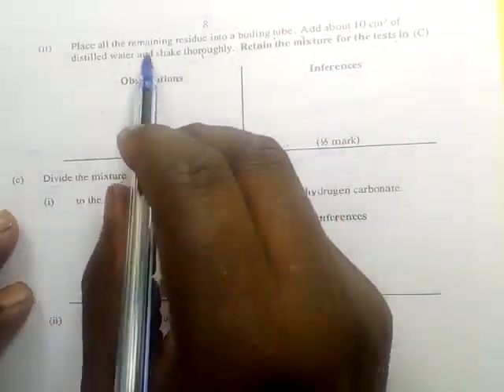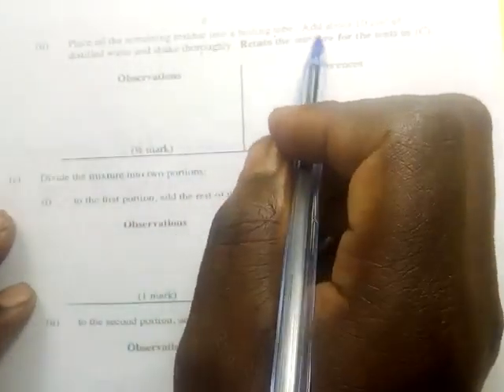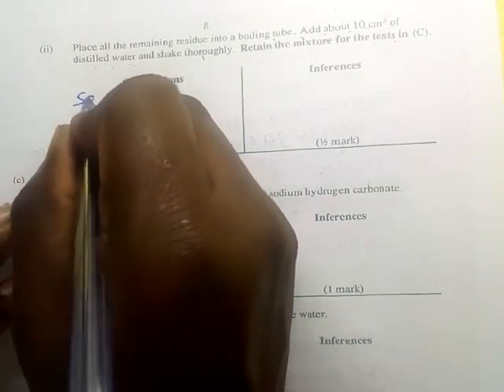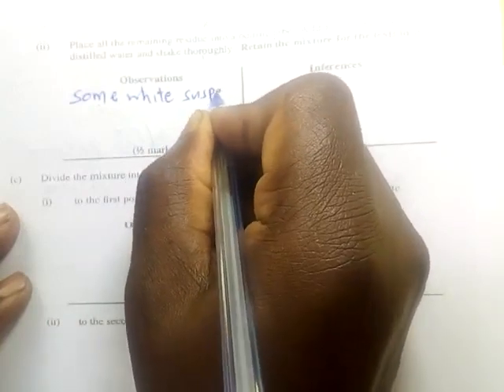So here we want to observe whether the residue dissolved in water or not. So the residue, some white suspension was formed.